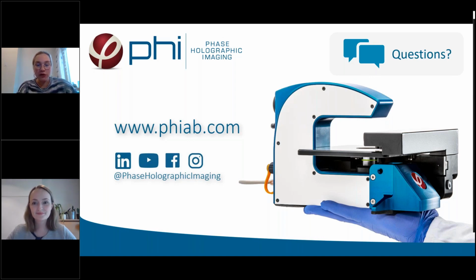Yeah, so the HoloMonitor supports use of a range of different vessels, from chamber slides to 35 millimeter Petri dishes, 6-well plates, 24-well plates, and 96-well plates. And as always, if you have any particular questions about a vessel, you can just shoot us a question by email and we will get back to you regarding that.